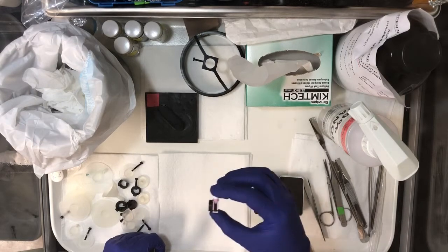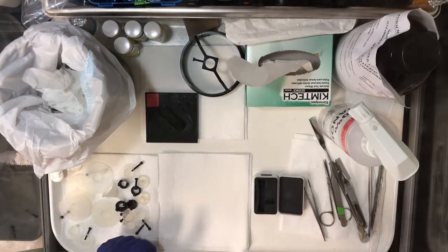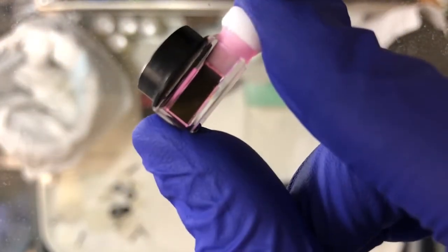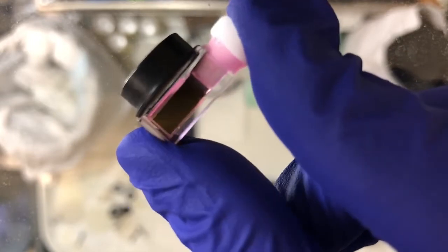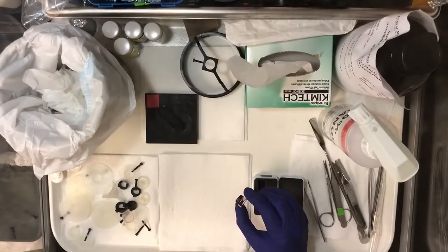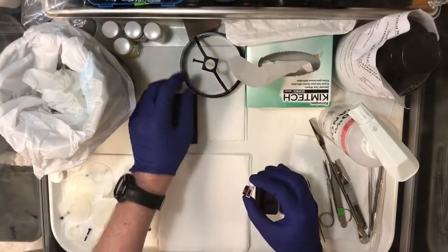Let me show it to you a little bit closer, see if this works. You can kind of see it there — I don't know if you can see the hole. But that's what the alignment tool looks like.